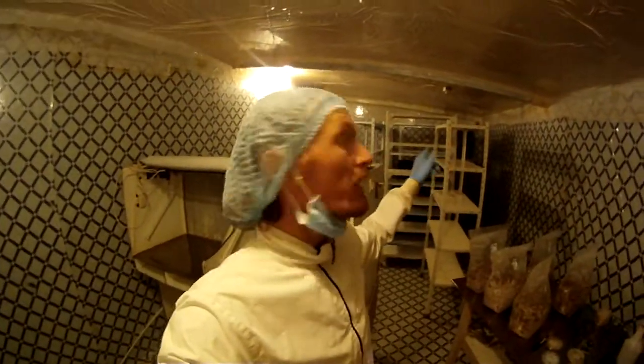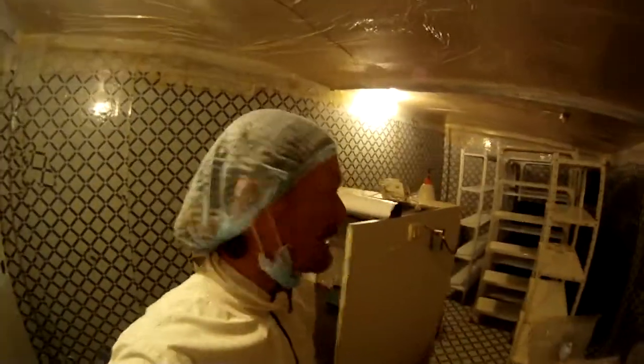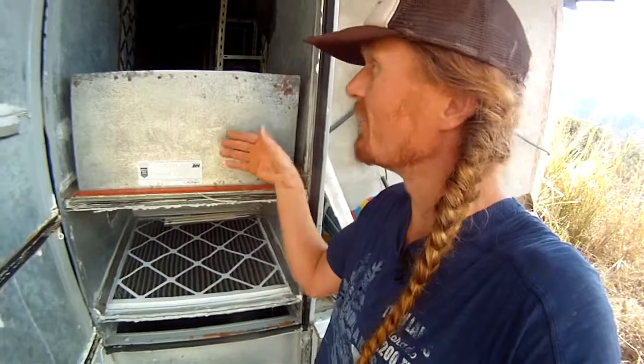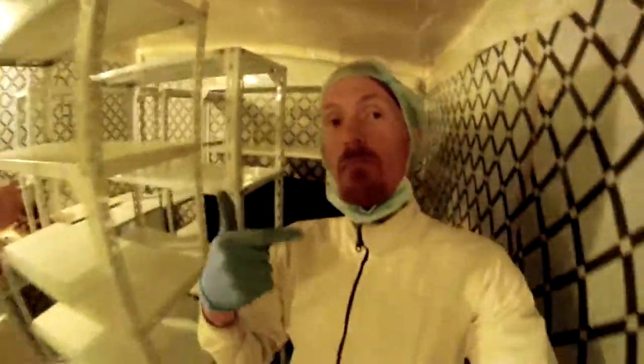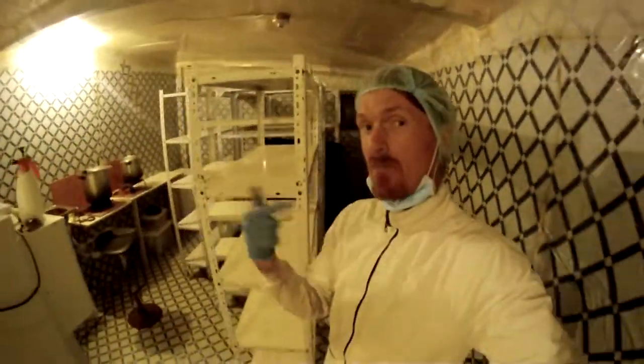Basically the idea is this is a clean space. It has a fan pushing air through here 24/7, filtered one, two, three, four times - the last being a HEPA filter. So that's a positive pressured lab setup. The HEPA filter is a true HEPA filter - a 12-inch thick HEPA filter that is 99.99% efficient in pulling out all the debris from the outside air. So this is pumping in clean air. I'm trying to mitigate myself as much as I can because I am the dirtiest thing in here.